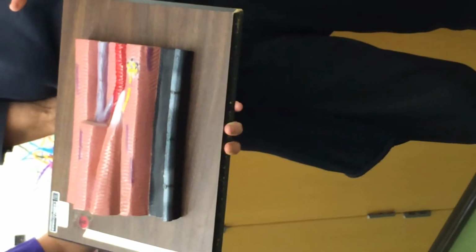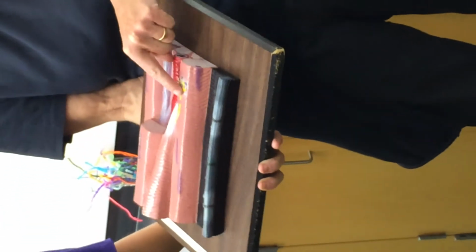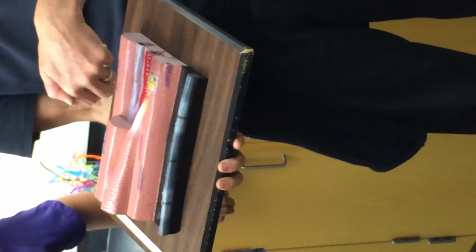Do you know the difference? It's okay if you don't. Arterioles are like tiny arteries, and they have smooth muscle. Can you see that muscle? They change diameter. That's a capillary. That's the smallest, thinnest type of blood vessel. Okay. So those are what those are. So the tissue is skeletal muscle. That's a neuromuscular junction, and the yellow bulbous thing is a synaptic end bulb, but the motor end plate is underneath there.